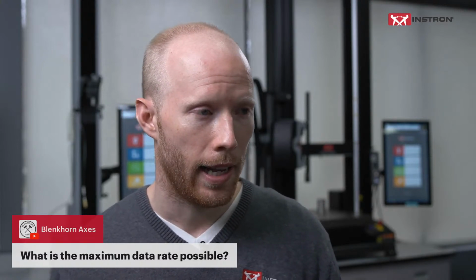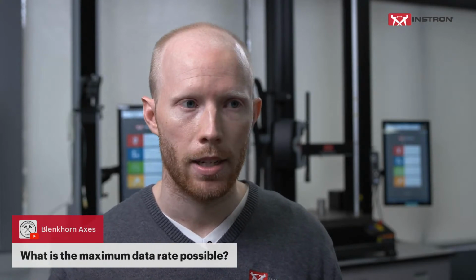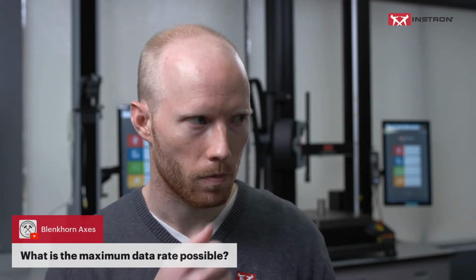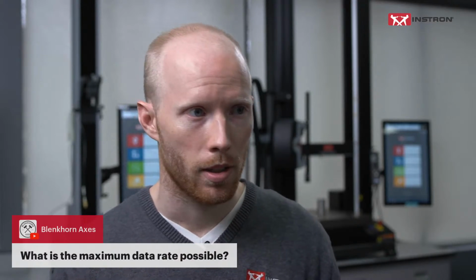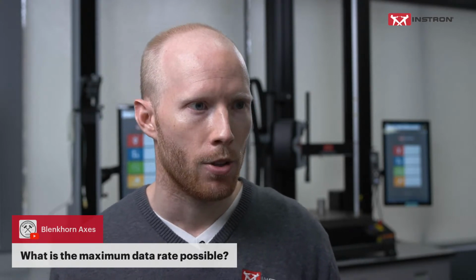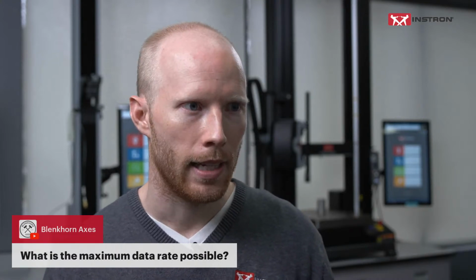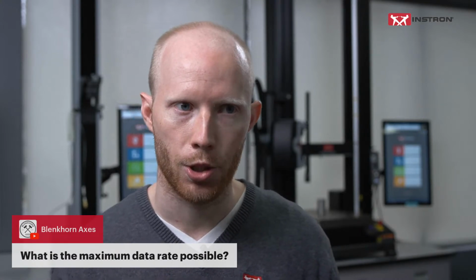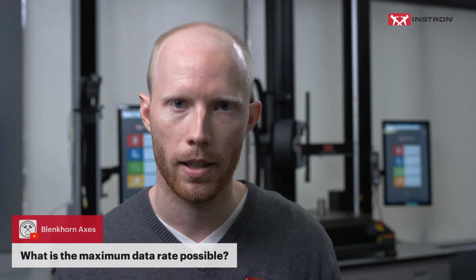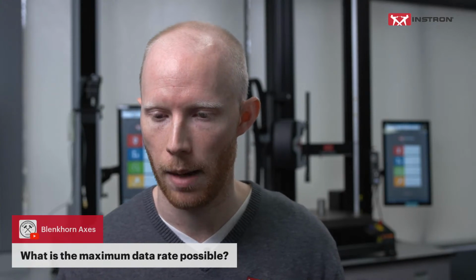That was a peel test, where we need a pretty high data rate to properly characterize those peaks and troughs. And 1,000 was almost 20 times more data than we really need. So picturing, oh, I want 5,000, it's very unnecessary for that type of application, and there are very few and far between reasons why you'd actually need that really high data capture rate.